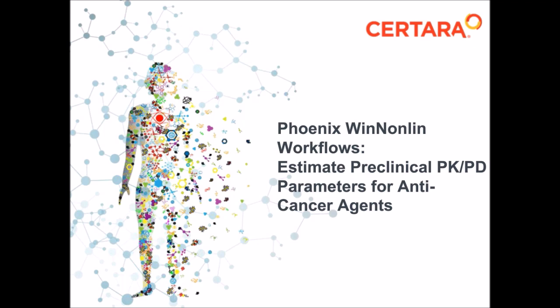Thanks, Suzanne, and welcome all attendees to today's webinar. It's always a pleasure to share some tips and tricks around Phoenix to a live audience. In this webinar, we will focus on Phoenix workflows, where we share an application in the area of preclinical development. As you can see from the title, we will deal with estimation of preclinical PK/PD parameters for anti-cancer agents.